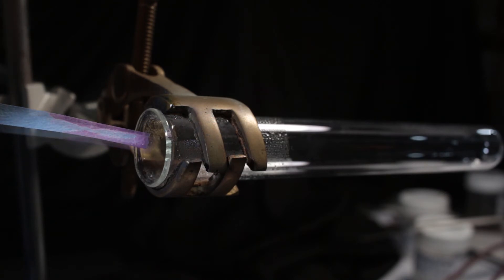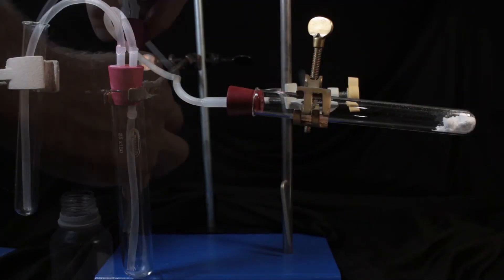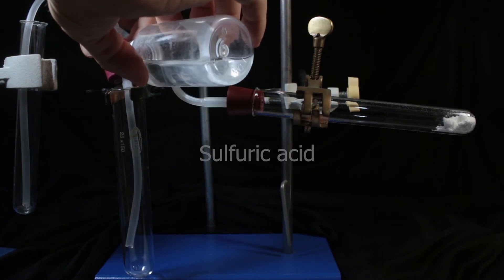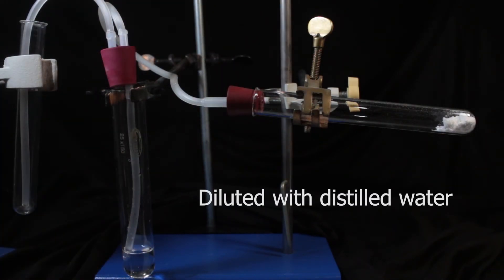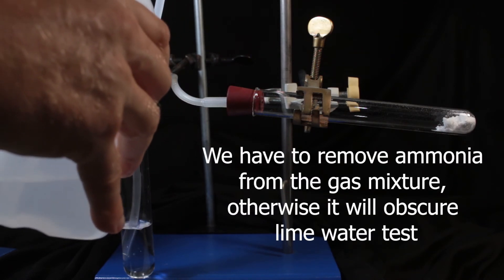Now for the third one, carbon dioxide. The test for it is not going to be that easy. I have to remove ammonia from the mixture. It would otherwise mess up with my lime water test. So I'm putting sulfuric acid in the middle, and I'm going to bubble the mixture of gases through it first.